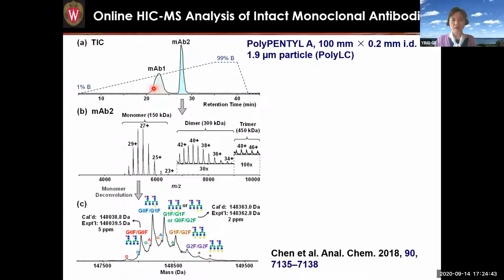We have been collaborating with AbbVie, and we separated these monoclonal antibodies nicely by HIC. And we can see the monomers, dimers, trimers, resembling the native mass spectrometry.